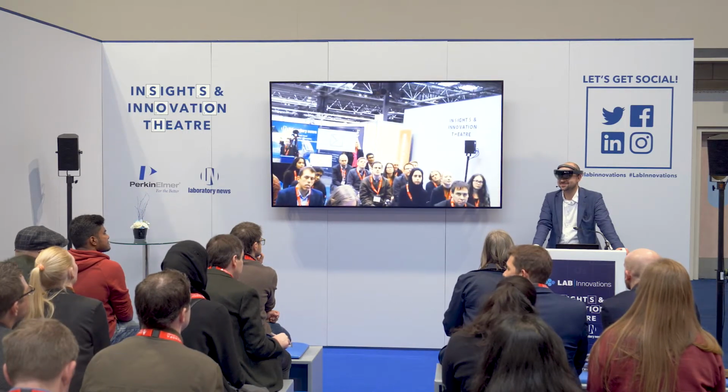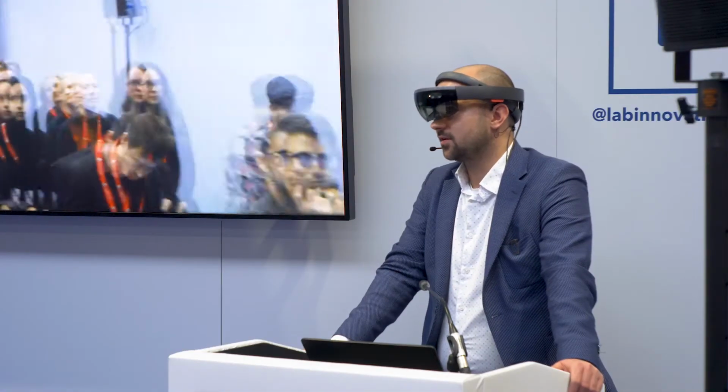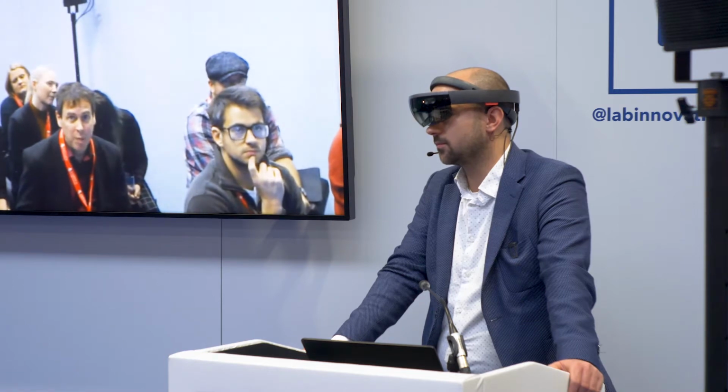Any more questions? Are people using it in the labs? In production currently, yes. Our software will be implemented in a couple of months in a few laboratories. Currently not.